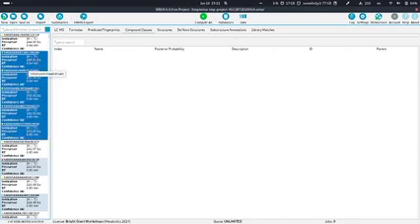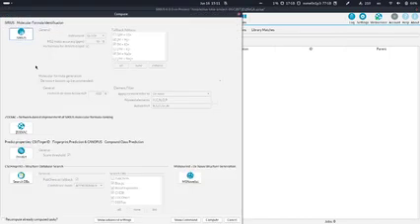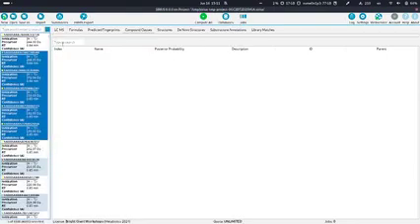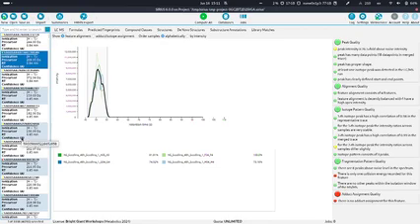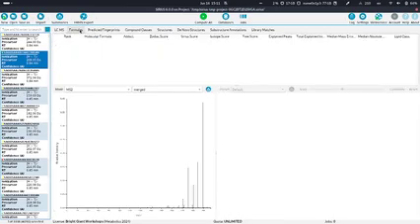So again, to get this, Mark, question? If you don't choose any adduct or database, it means all of them are included, correct? You mean the LCMS tab? No, that's with filtering. The list on the left, at the top, the blue filter tab.